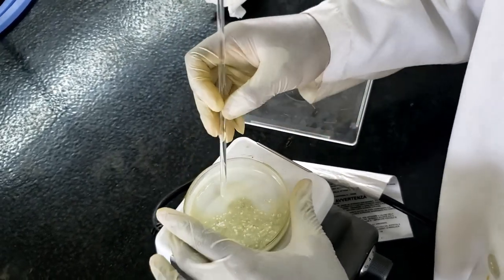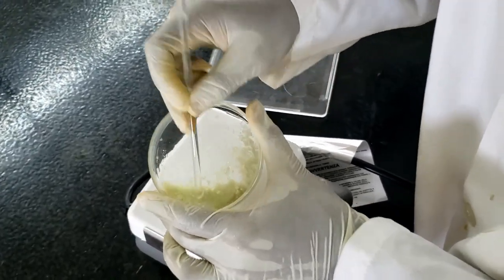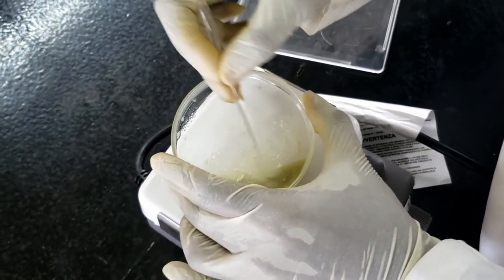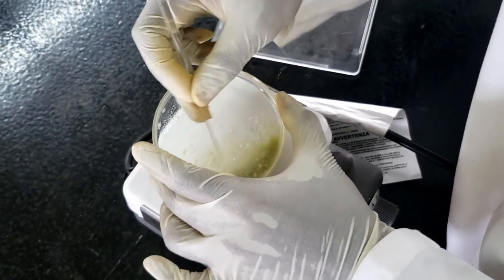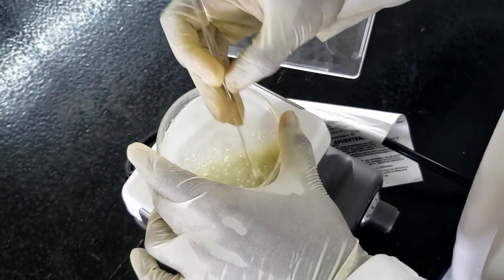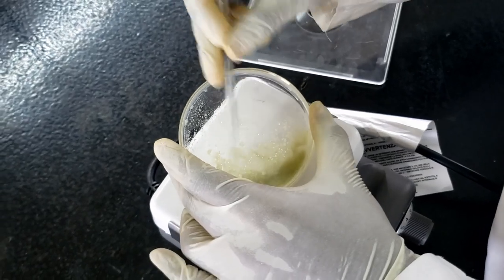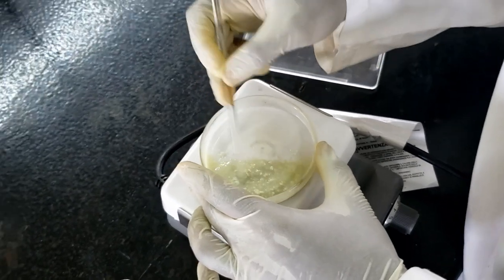The bromonitrobenzene has this sweet, pleasant odor. So that's oftentimes a nice odor to smell from this lab. I wouldn't recommend you inhaling it too much though. Okay, so that's pretty good.